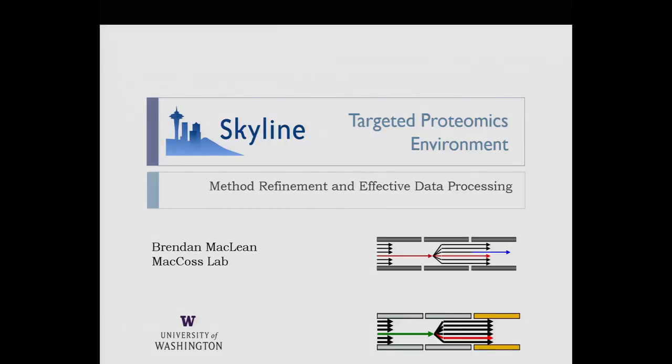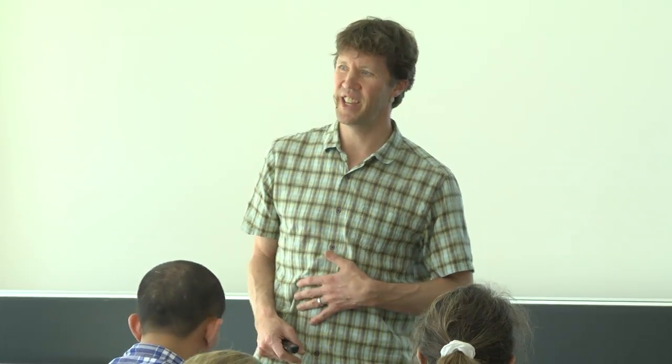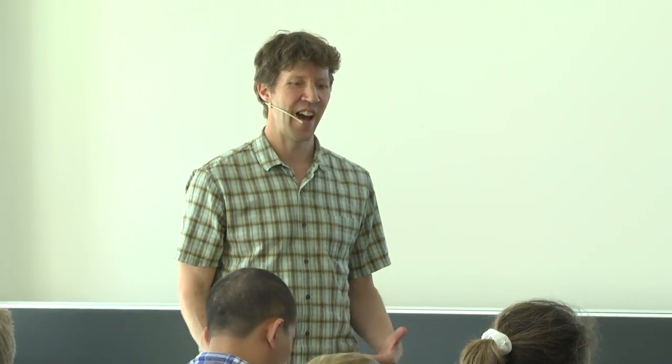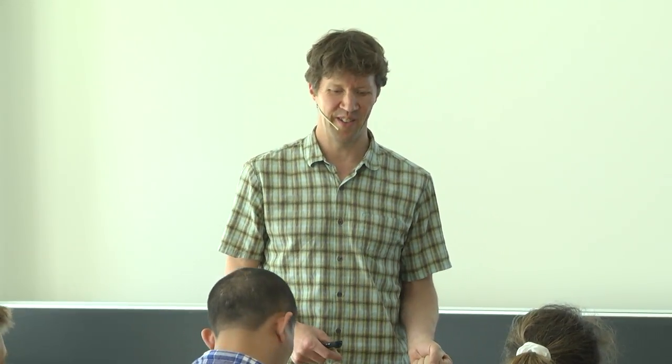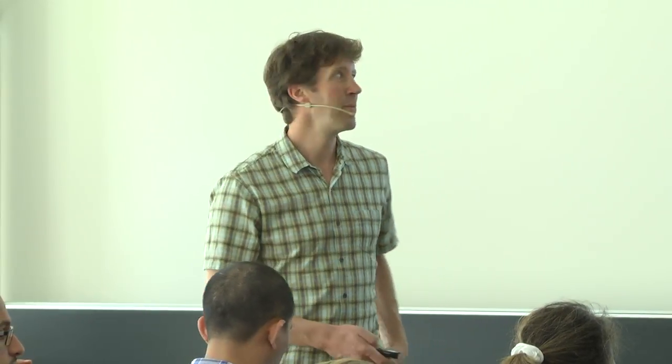I'm going to try to go through some slides pretty quickly, and then heavily focus on actually using the software and give you some ideas of what I find is the optimal way to use the software. And I've checked this with a lot of people who use it a lot, and they also feel that these are some of the most effective ways of using the software.